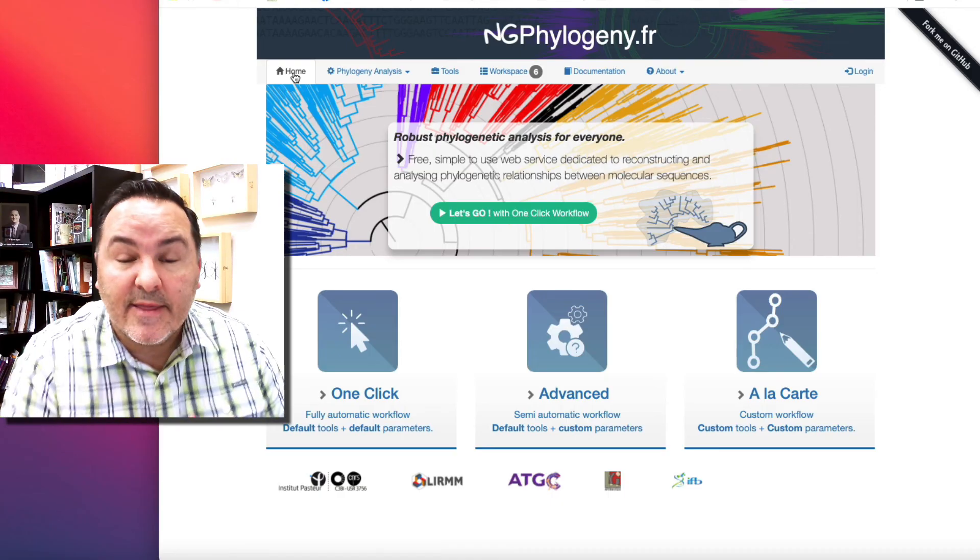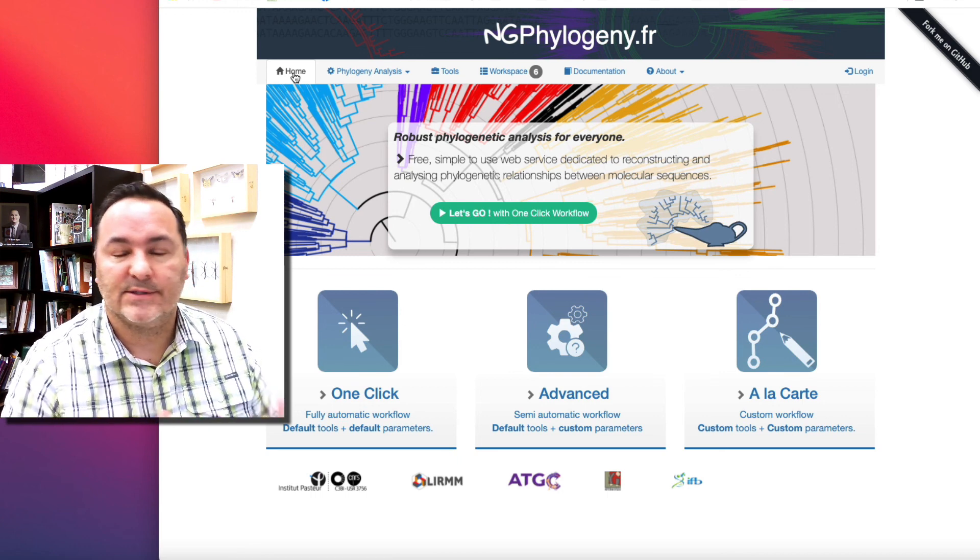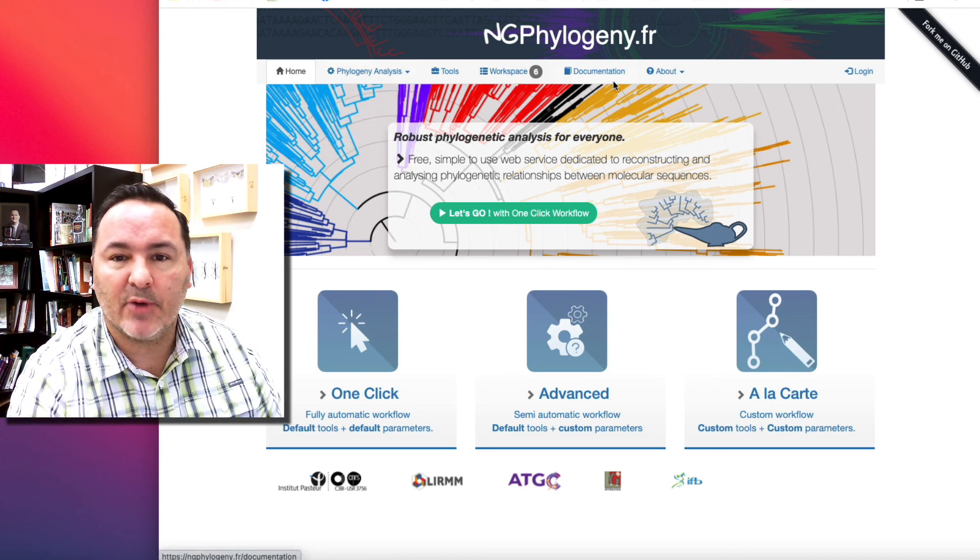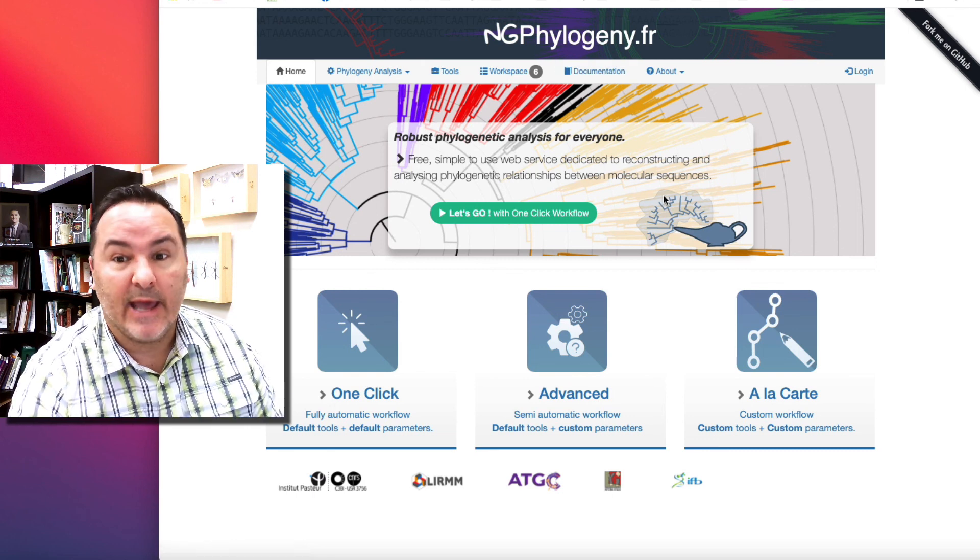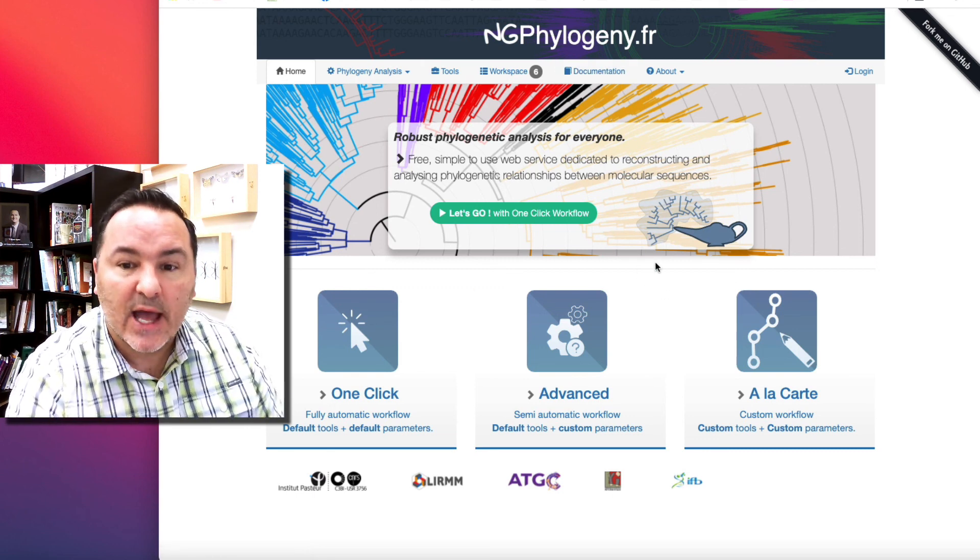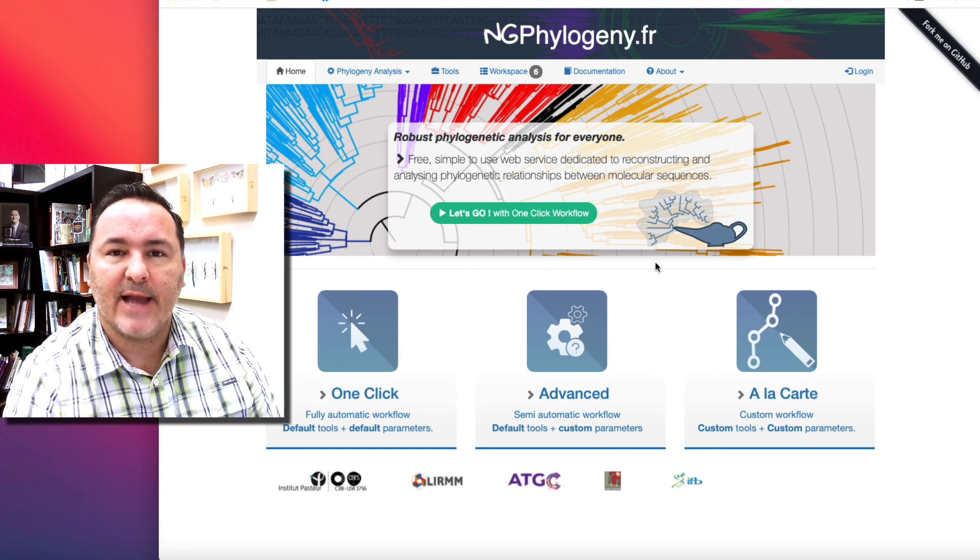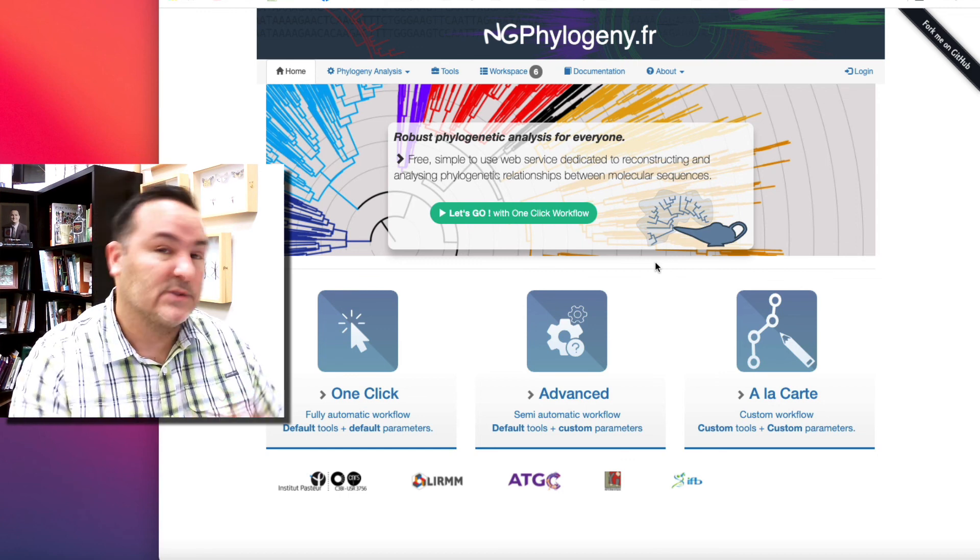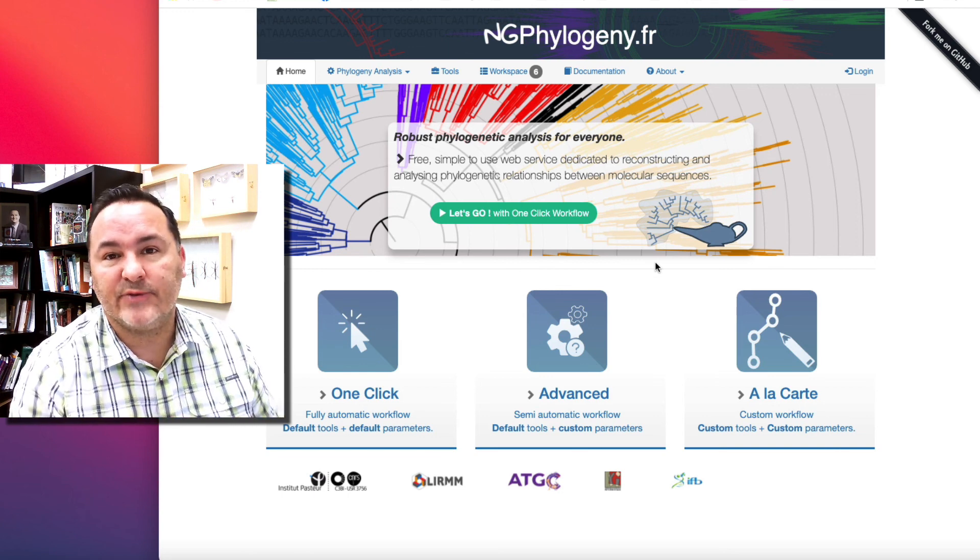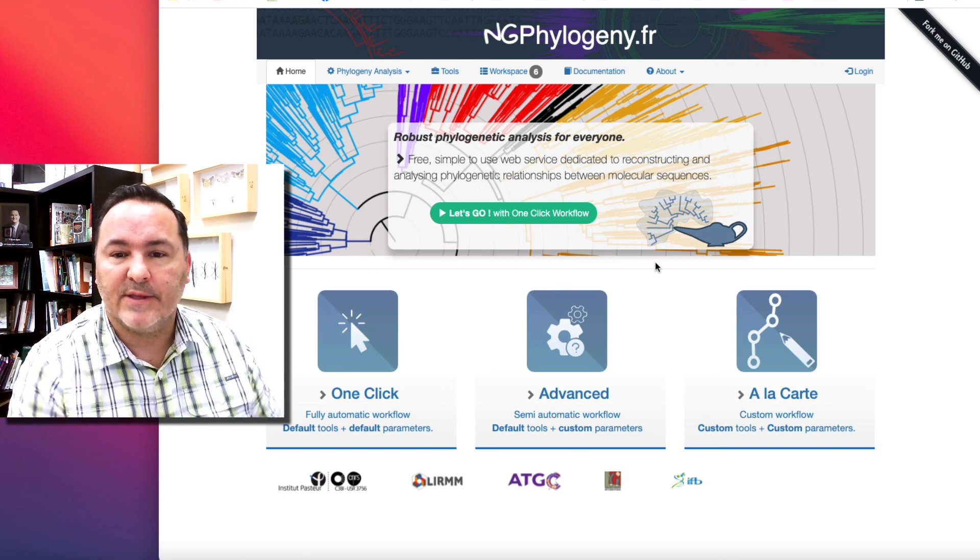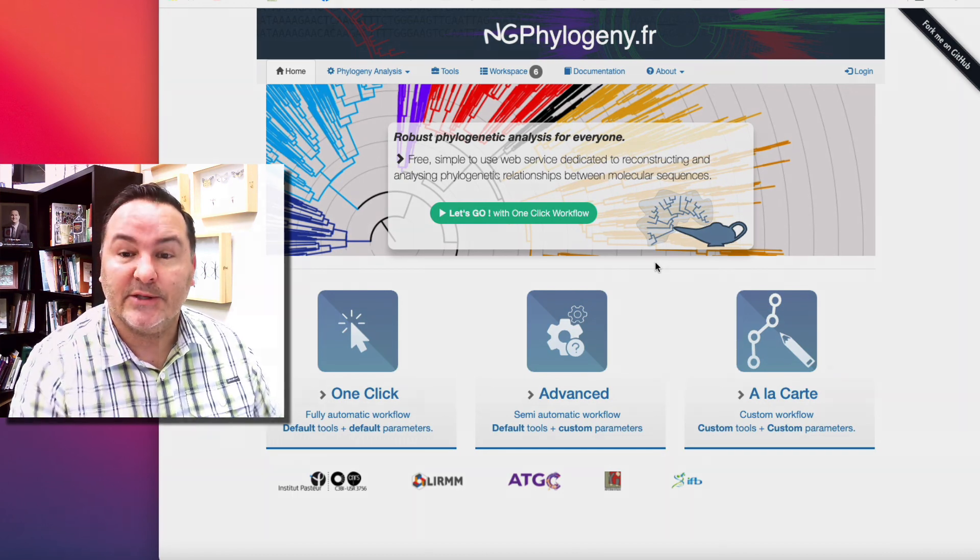That is the ngphylogeny.fr site. So feel free to play around with this. It's got pretty good documentation and lots of different tools that you can use. And this is enough to carry out all of your phylogenetic analyses for your poster. There are tons of other programs, and if you're really interested, I can lean you in those directions as well. But this should be pretty close to be able to do what you need to do.